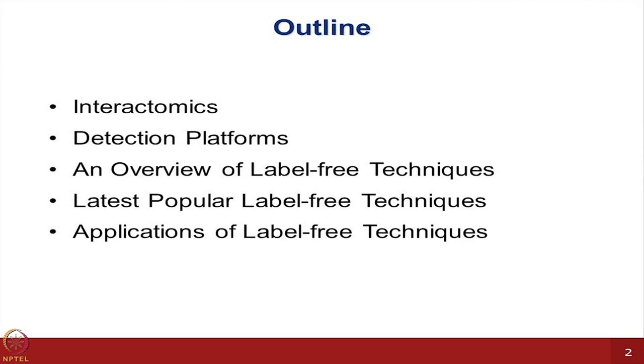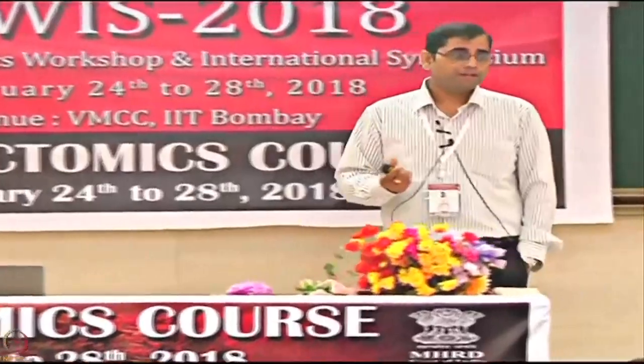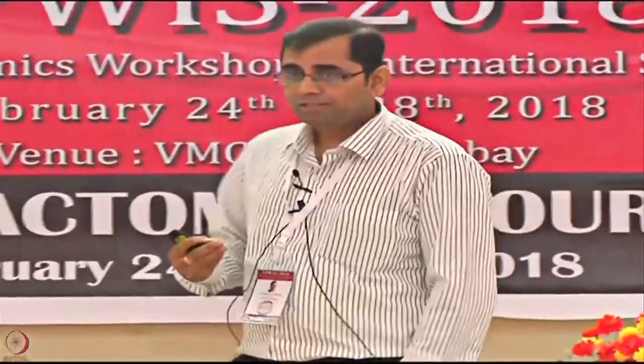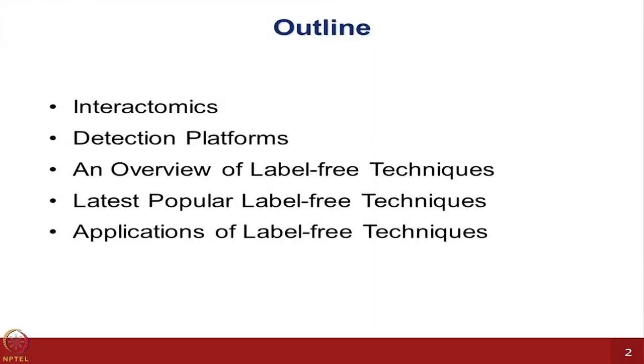So, a brief comparison of those two types of detection platforms, and some overview of the label-free technologies. There are many, in fact. You just got some exposure to SPR yesterday, surface plasmon resonance, but there are many emerging technologies which have started making some impact. But many of them are still in the testing phase. Some of the latest popular label-free technology platforms we will cover as we go along in the course. And then a brief overview of applications.